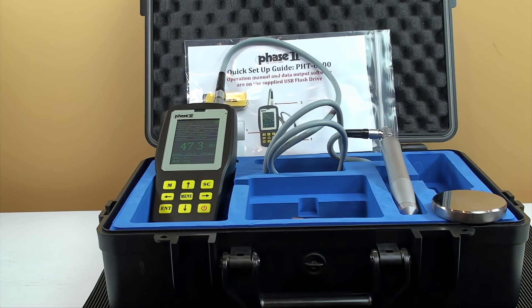The PHT6000 is designed to test metals, primarily steels, aluminum alloys, and copper alloys, but other metals can also be calibrated and tested using known calibrated standards of that metal. Because Young's modulus is the determining factor in this technology, these open architecture testers calibrate to material type and can be read in virtually any hardness scale.